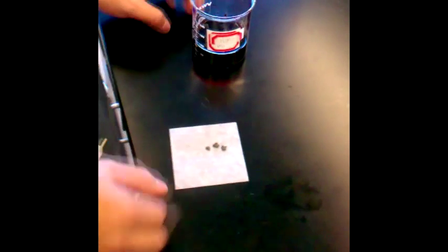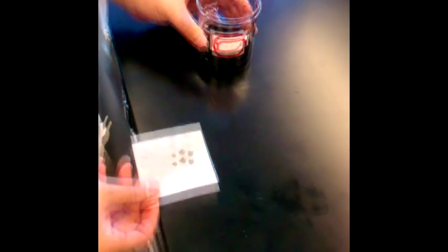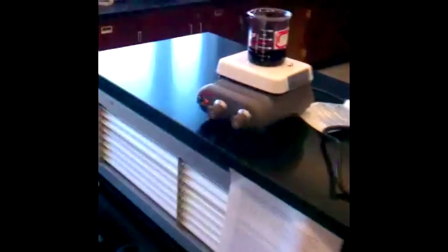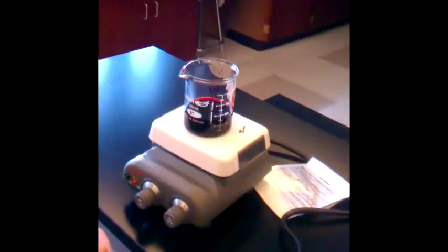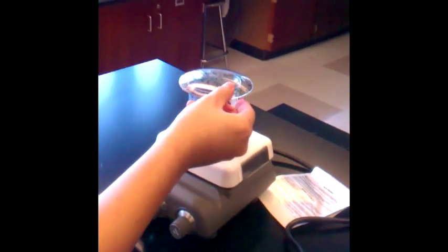We will now add the pre-weighed boiling chips and drop them into the filtrated solution. If you forget to weigh the boiling chips, you will have to remove them at the end of the experiment and weigh the boiling chips separately.